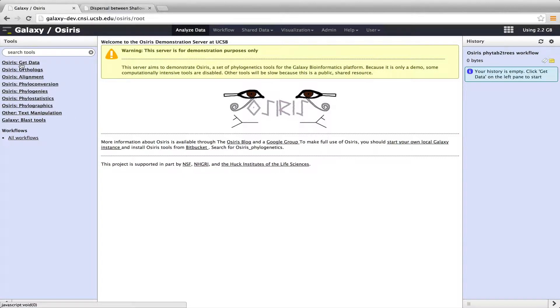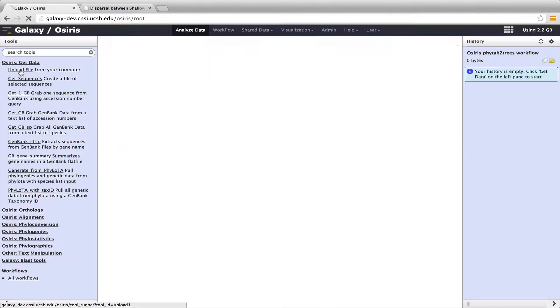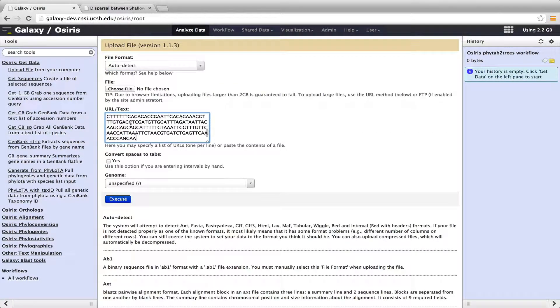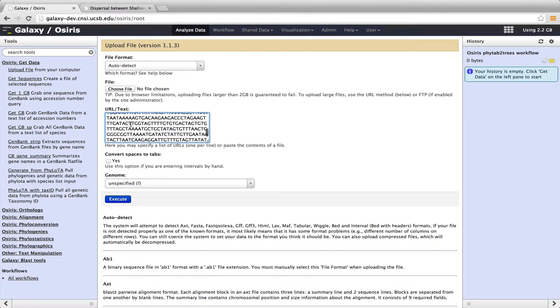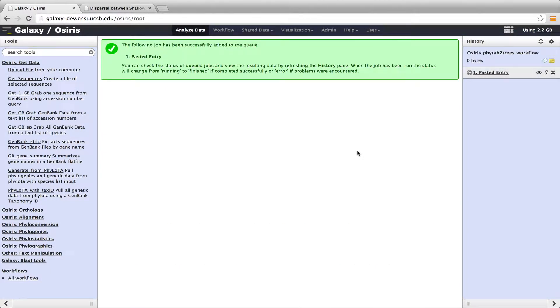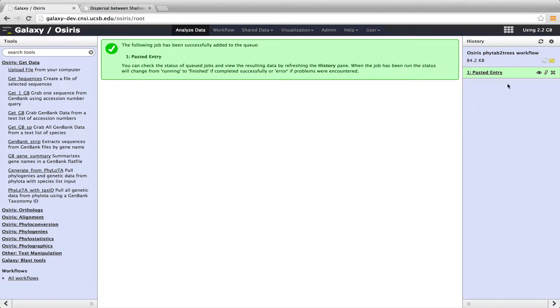And we'll go over here under Get Data, and we'll do Upload File. So I'm pasting those data in, and then I will hit Execute. I've already named this history over here, OSIRIS PHYTAB2Trees Workflow. So I'm going to actually use a workflow that I've already prepared to generate phylogenetic trees from these data.